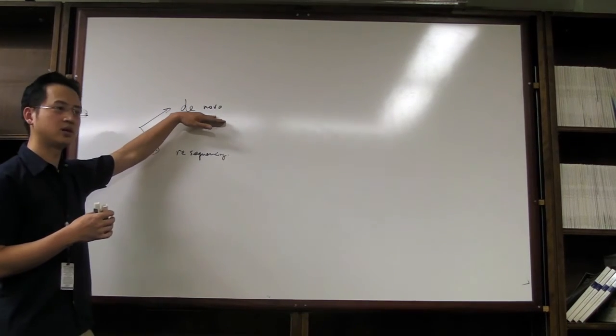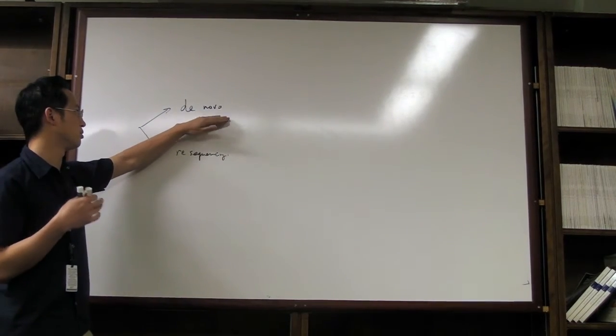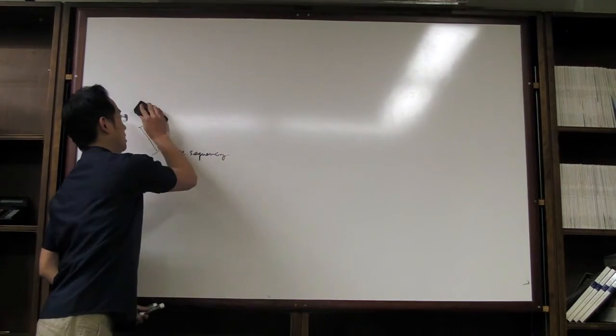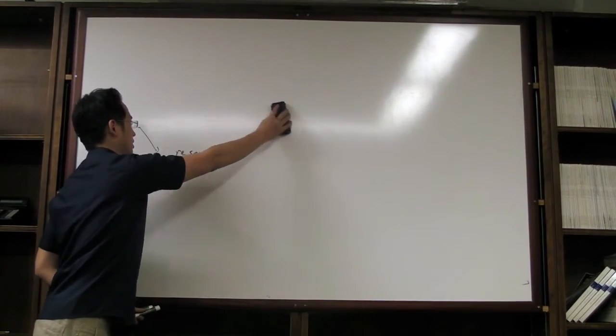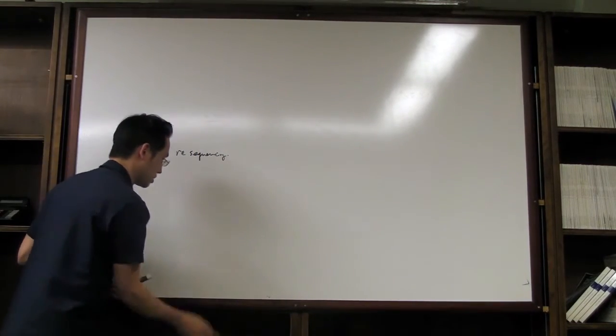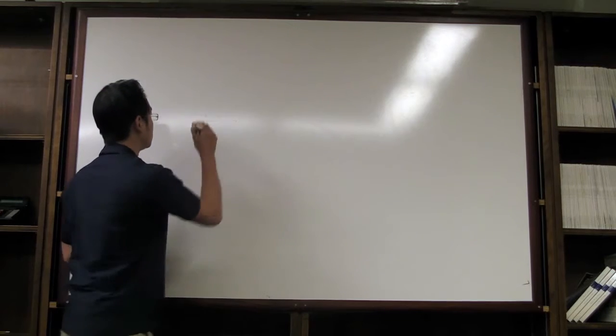For all novel discoveries, brand new organism you don't know about, that's de novo sequencing. So we're not into this business here. That's more for research and discovery. We're into this business here. So what you need for resequencing is a reference.